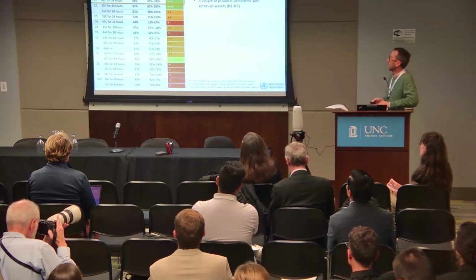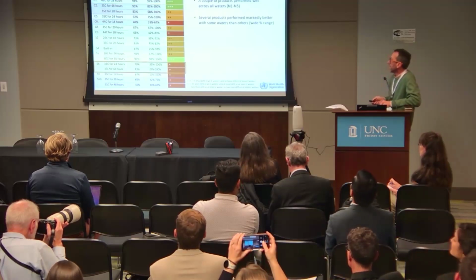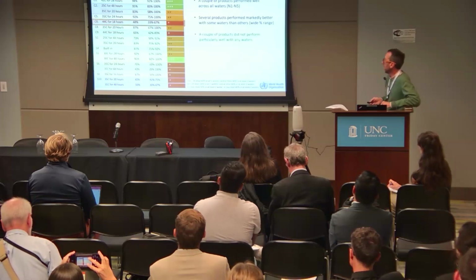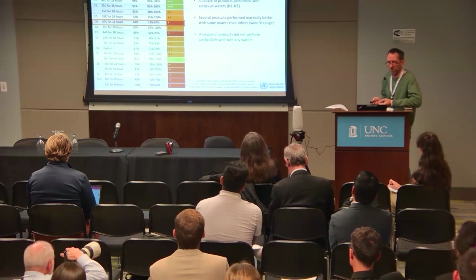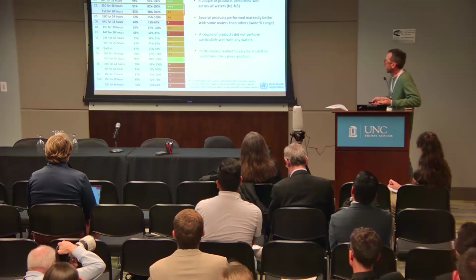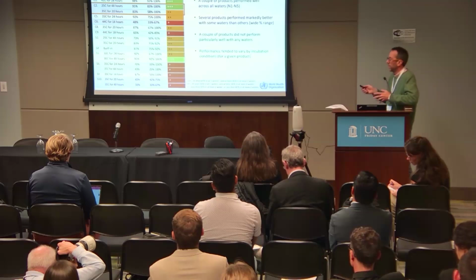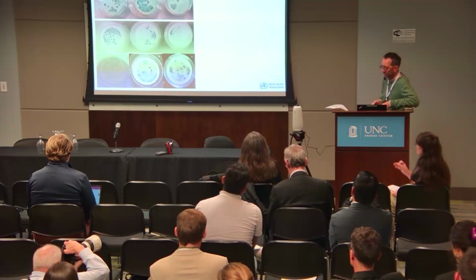And we found a few products that worked really well across all 5 different test waters. We found several products that worked quite well with some test waters, but not so well with others, so were less consistent. And then a few products, especially some emerging, not yet ready for commercial prime time products, really didn't work well on any waters at all. Also, we found that some products advertised that you could incubate at one set of temperatures and times or another, and there could be some differences by product for incubation conditions.